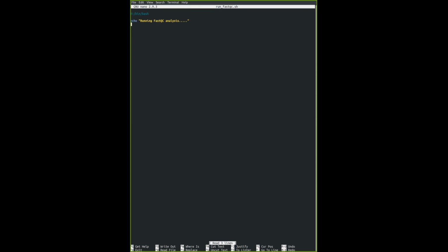So I'm going to create a separate line and change the directory to RNA_seq. I'm sorry, you cannot autocomplete this. You can try as much as you want, it will not autocomplete. So you have to type in very carefully. I will also tell myself that right now.